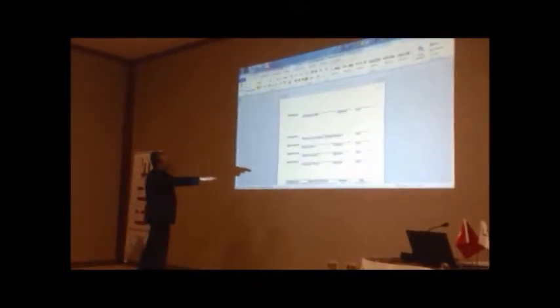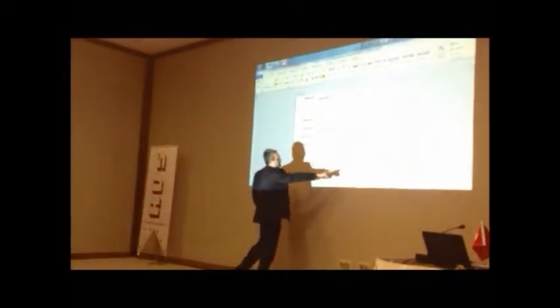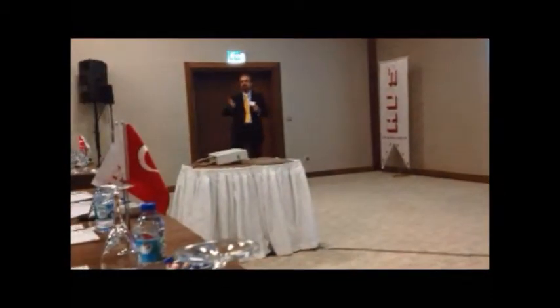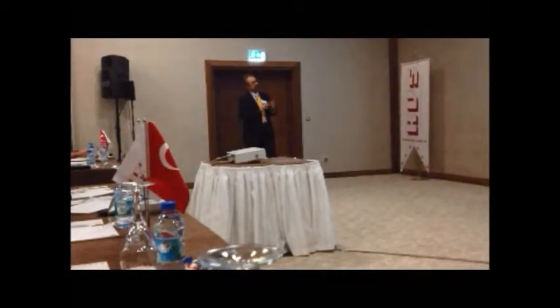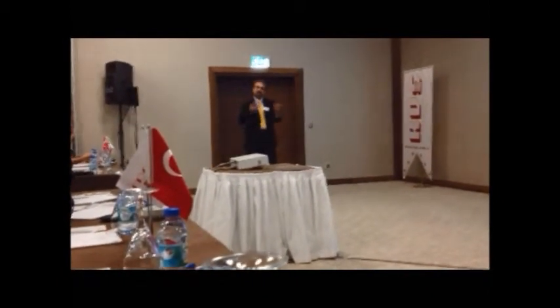and this is the first emission for the approval. Then if you receive the protocol and you say, I want to add some tests because I had an inspection that asked me this test, I want to take away one test, I want to do other things, you make the correction, you send us again, we make the second review, and then we start to work.